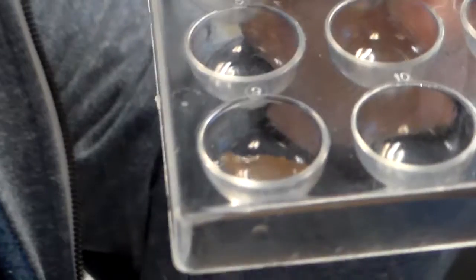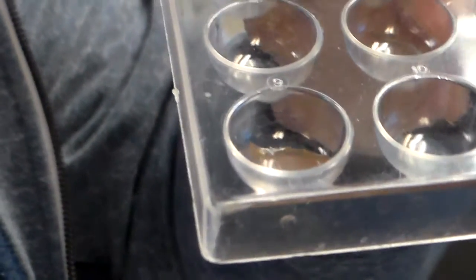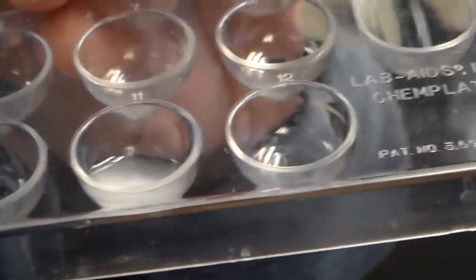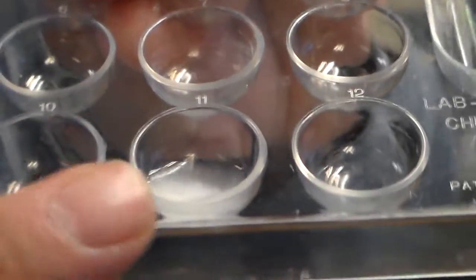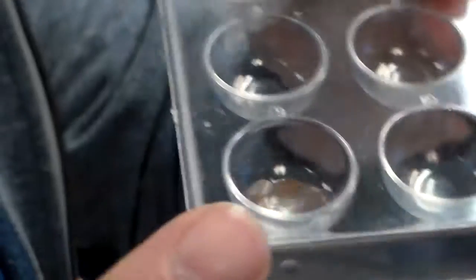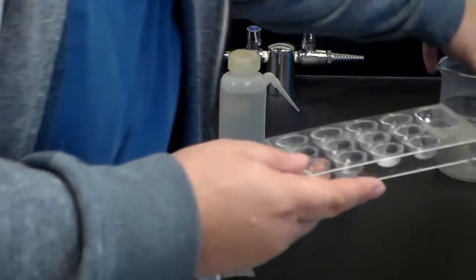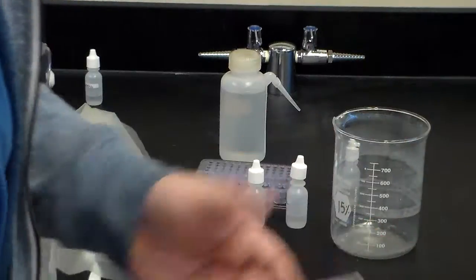This is a negative result. No precipitation is formed. Well, the 2 chemicals combined, they're floating around in there, but nobody is joining up with anybody. They're just floating around in pieces. Unlike here, where this is a positive result. This is a positive result. This is a negative result. Notice the difference.